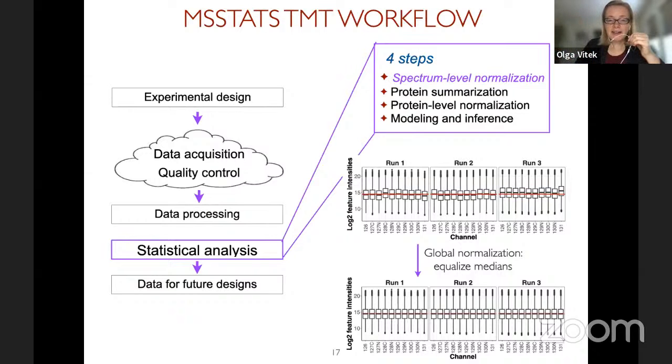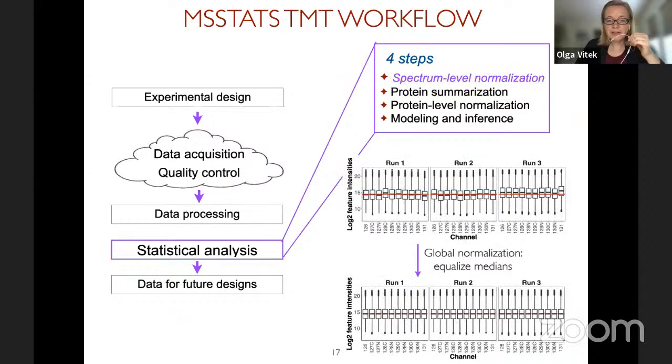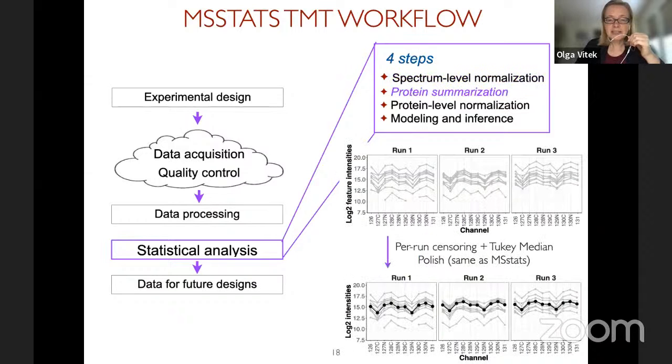After that, everything we do is done separately for each protein. So this was all proteins together. Now the next step is separately for each protein. As we have seen, in different runs, we will have different peptide ions and different PSMs. This run has more PSMs, this run has fewer, this run may have some others, so that the intensities between the runs are not comparable.